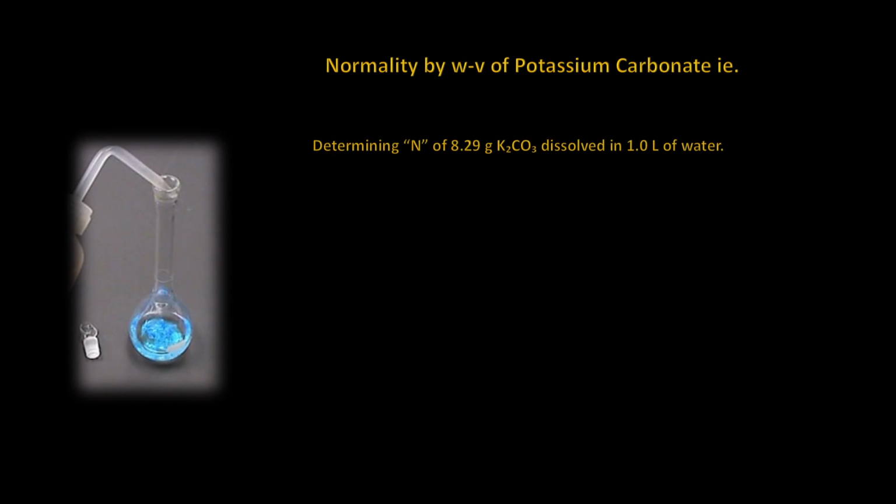There are many examples of titration procedures, both in textbooks and online. Many will show that a titrating reagent is listed in normality instead of concentrations of volume to volume or weight to weight, etc. Remember that the GEW, or grams equivalent weight, is equal to the mass weight of the species divided by the number of equivalents.